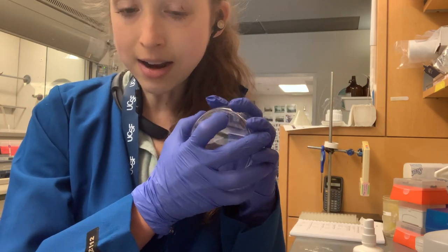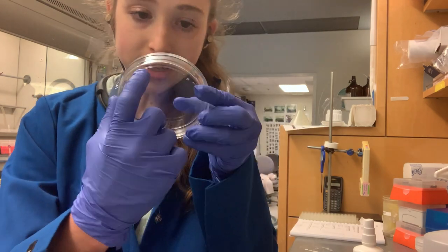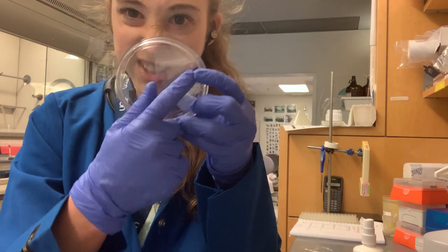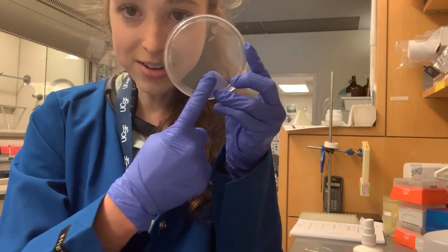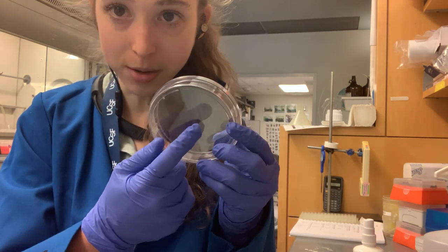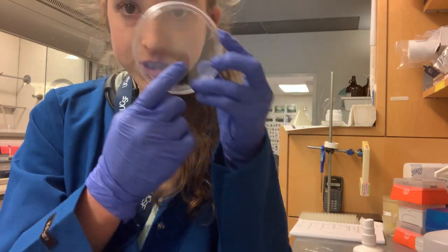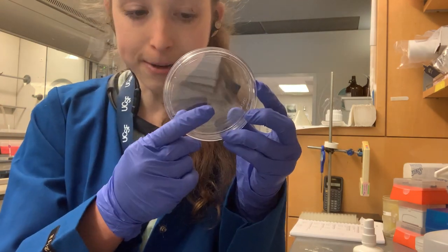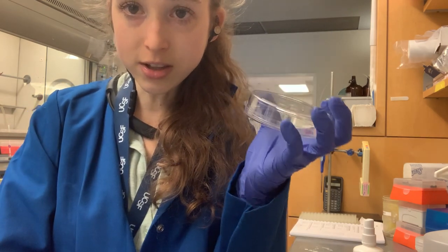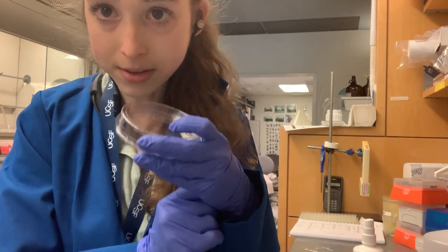Include the date, et cetera. It's really helpful with bacterial plates that you can write along the edges — don't write all the way across the plate, because then you can't tell if that's a colony or a Sharpie mark. Write along the edges so you can see things more clearly. It's nice for bacterial cells because you typically store them upside down, so condensation isn't going to plop onto your plate and grow weird stuff.